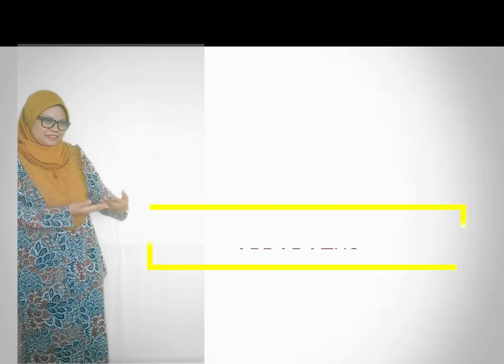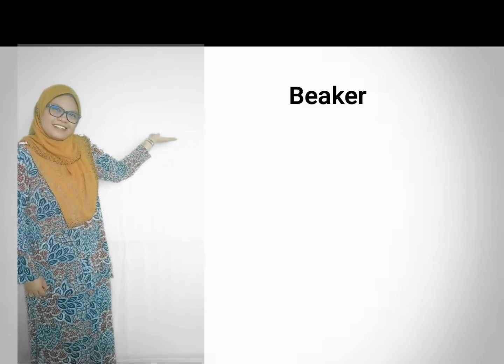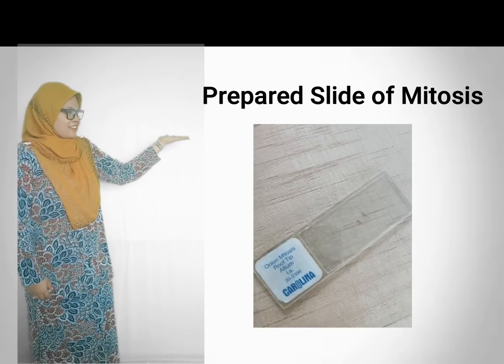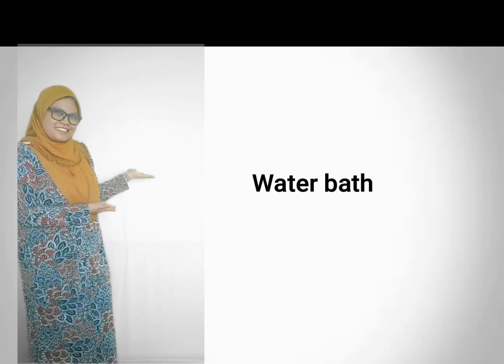Let's check out the apparatus: compound light microscope, beaker, blade, needle, prepared slide of mitosis, slide and cover slip, watch glass, and water bath.